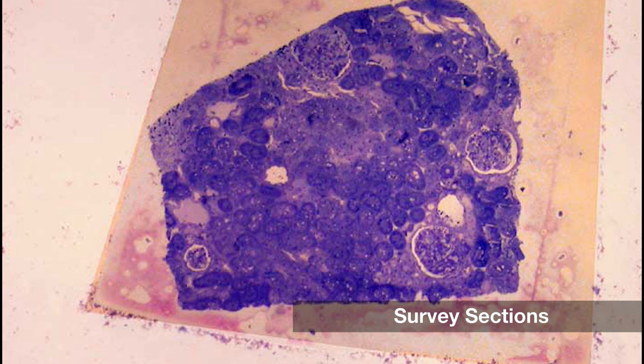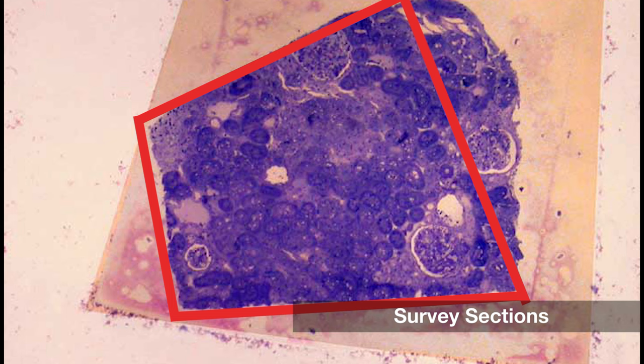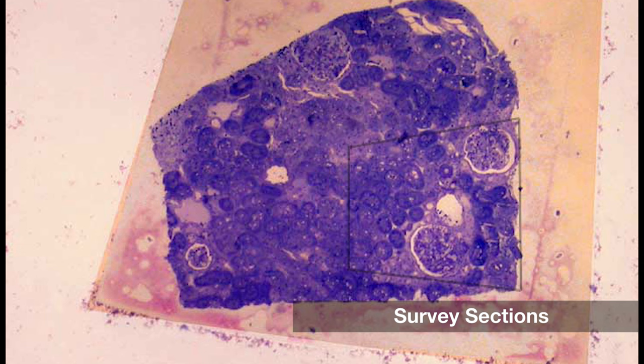Note the trapezoid shape of the block. Cells and structures are colored blue with the dye toluidine blue. This section also shows precipitation of the dye on the section.